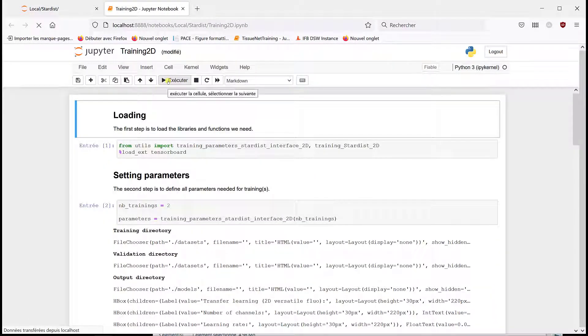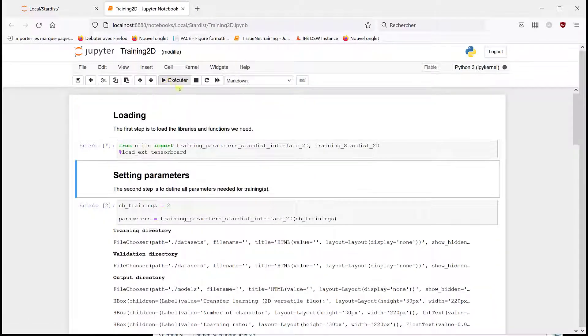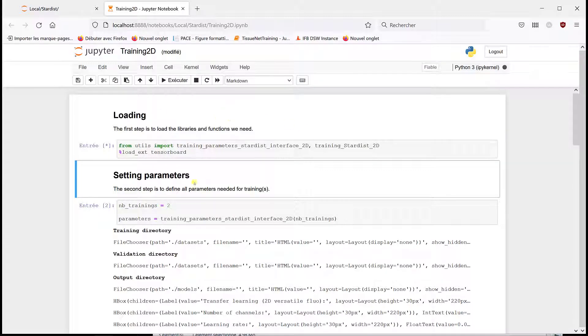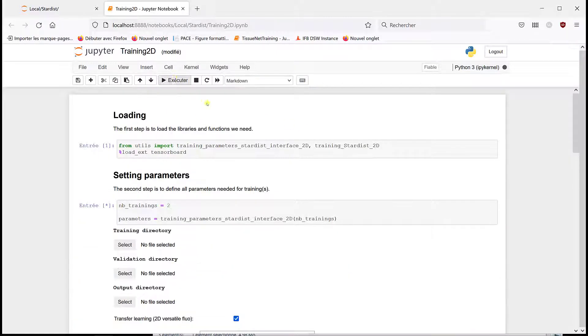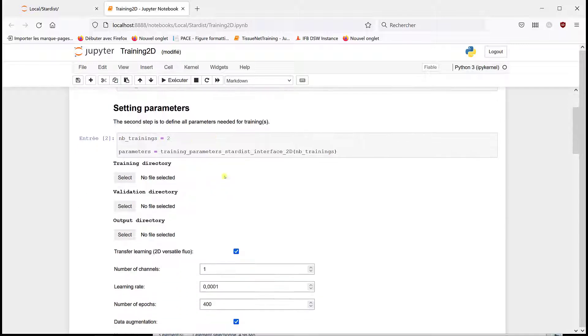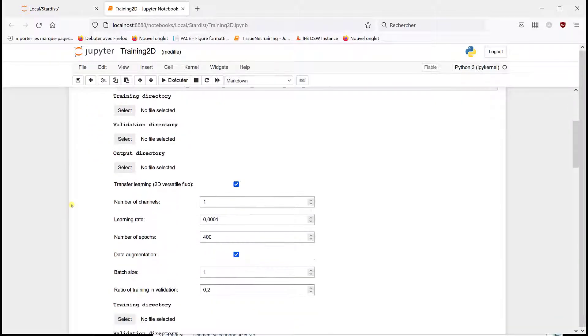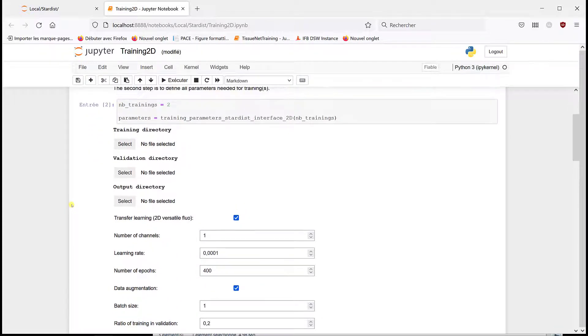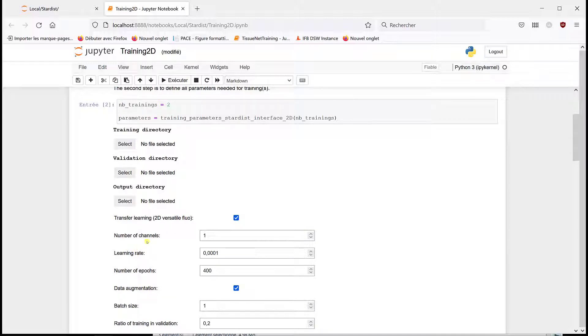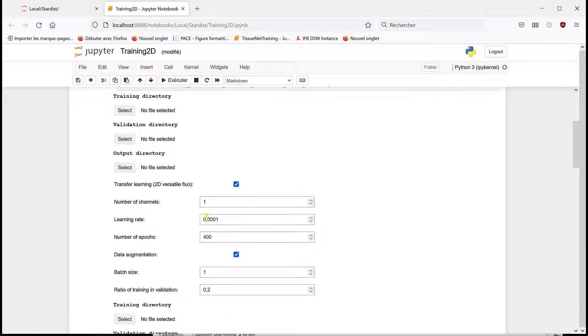It works like before. So we have all the codes here. Then I'm going to do two different trainings. I'm not going to play with the learning rate. I know that this one works pretty good, but here, as you can see, we can do a transfer learning.